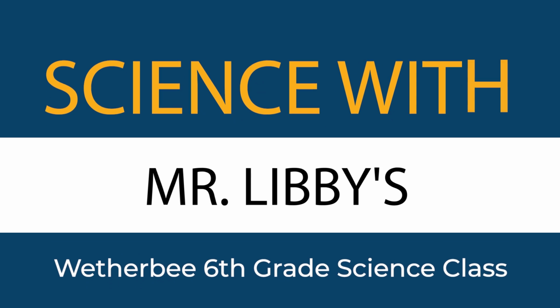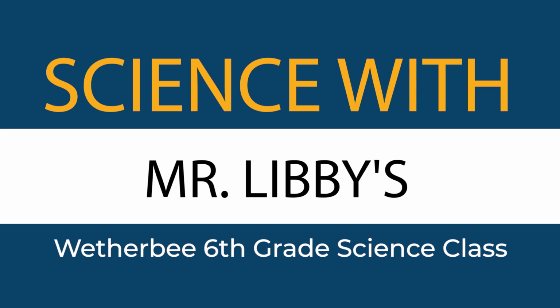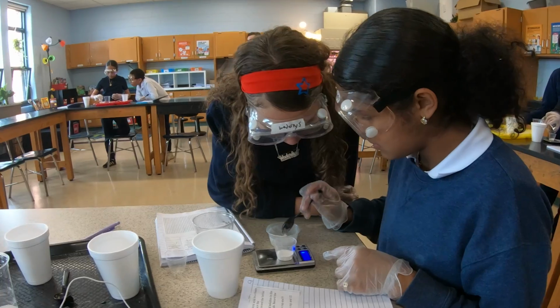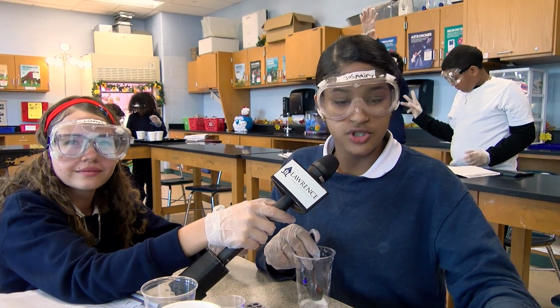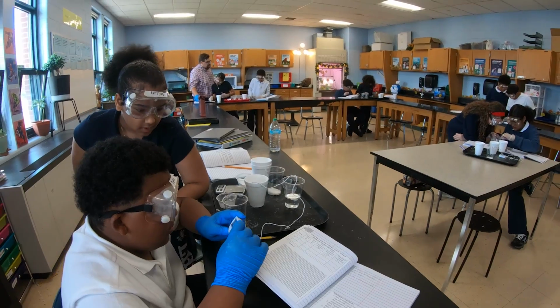Hey, we're here at the Wetherbee in Science class today working on chemical reactions with 6th graders. Today, students are exploring endothermic chemical reactions. Today we are doing a lab about comparing temperature change of citric acid and baking soda chemical reaction.